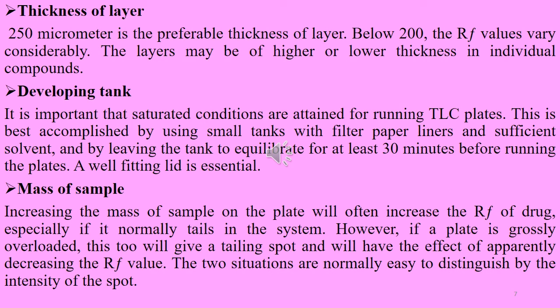Thickness of layer. For standard plates, approximately 250 micrometers is the preferable thickness of the layer. Below 200, the RF values vary considerably. The layer may be of higher or lower thickness for individual compounds.